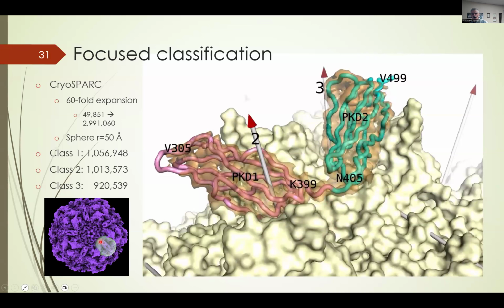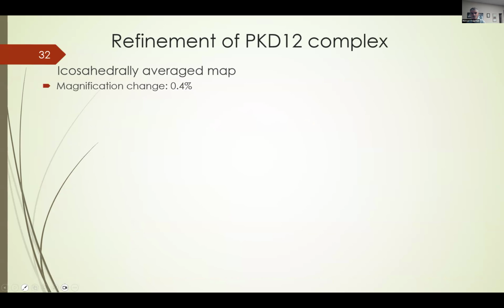And this is coming out of a focused reconstruction of a spherical volume. But what was essential to know was where to place this mask. And I think probably our earlier attempts at focused reconstruction had failed because we didn't have the mask sufficiently well positioned. So the refinement was multi-step. I'm now filling in some of the intervening steps, and I'll go through them very quickly.